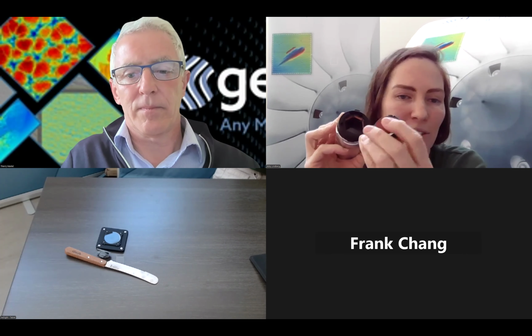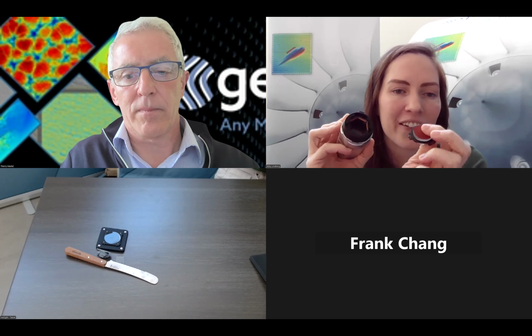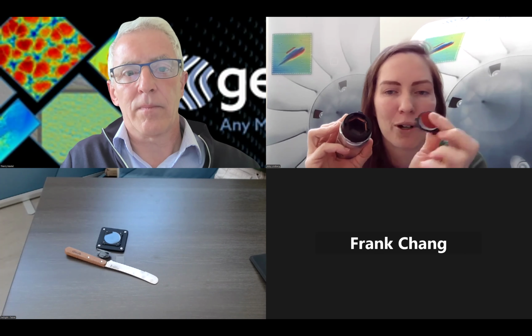All right. And we have the next question here. It says, is the non-contact 3D surface analysis just made with the camera or also with laser technique? So the GelSight system is a contact-based system, but it is going to be non-destructive contact. We have a soft gel sensor. It's kind of like your fingertip. So we are taking images of the surface through the contact of the gel sensor. This gel is going to be what conforms to your surface.